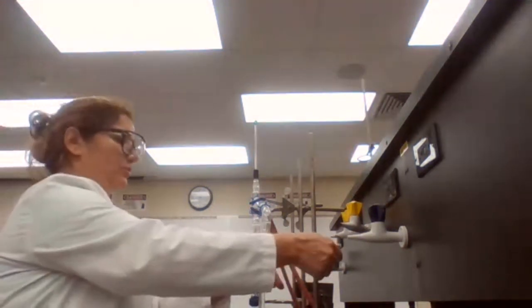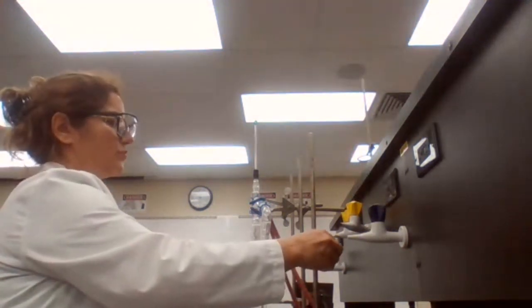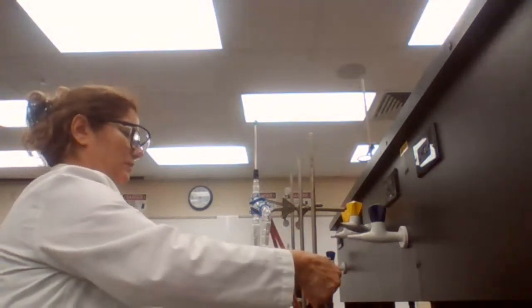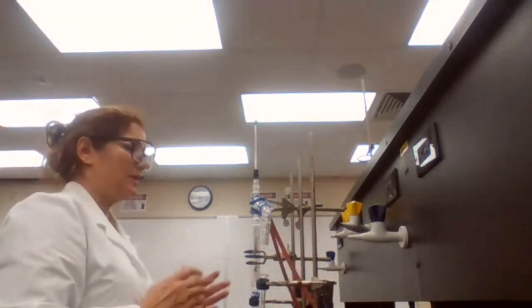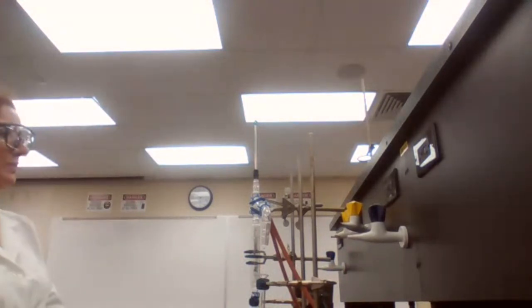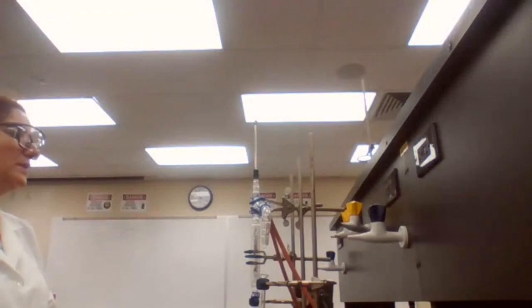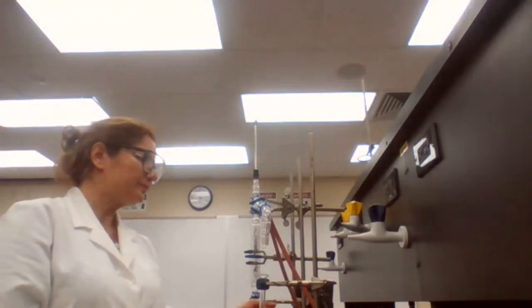So we make sure that there is no drop coming out before we remove it. So wait, and in 2 minutes, if there is no drop coming out, then I can deassemble the fractional distillation.